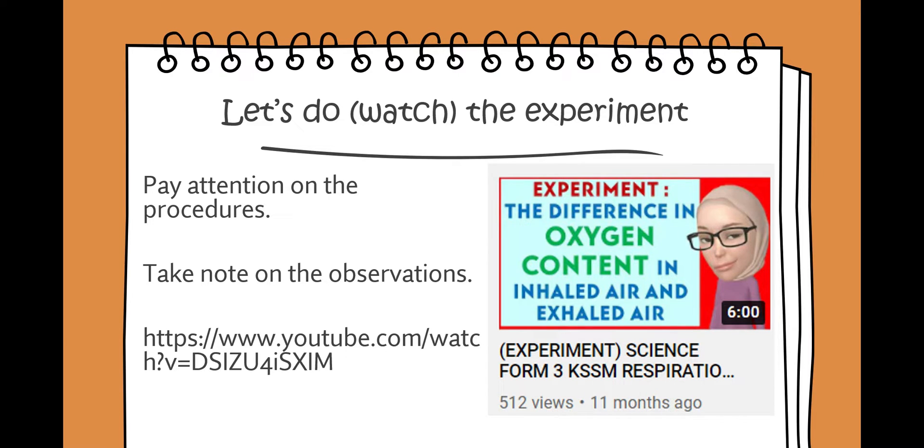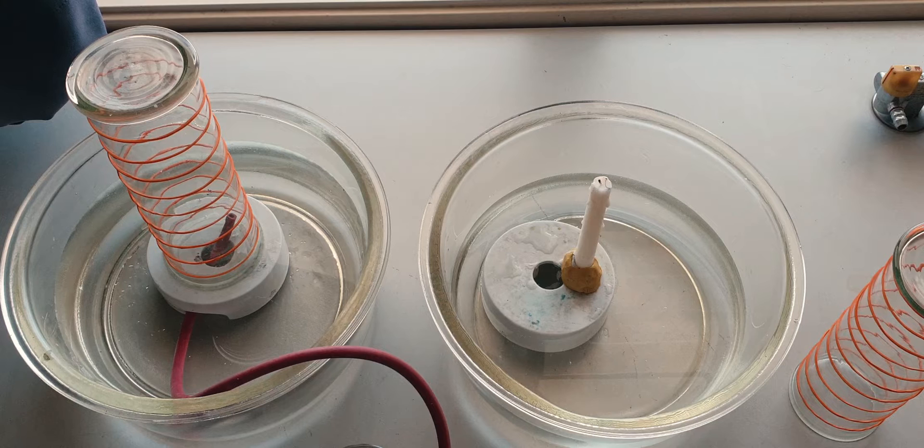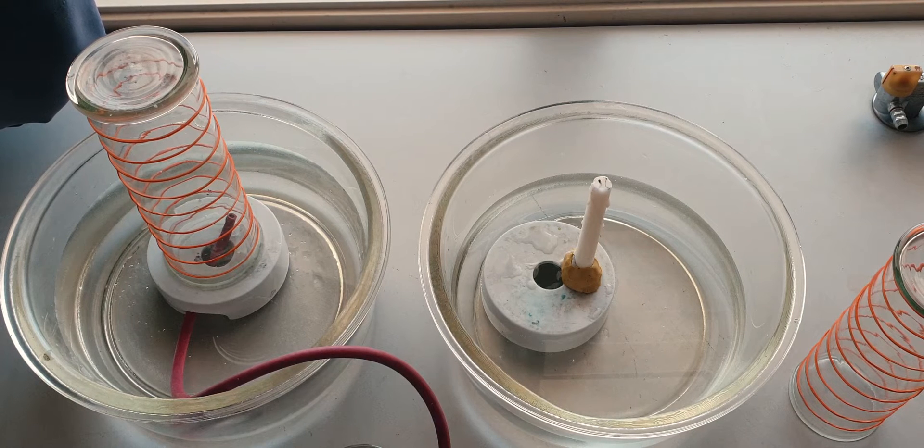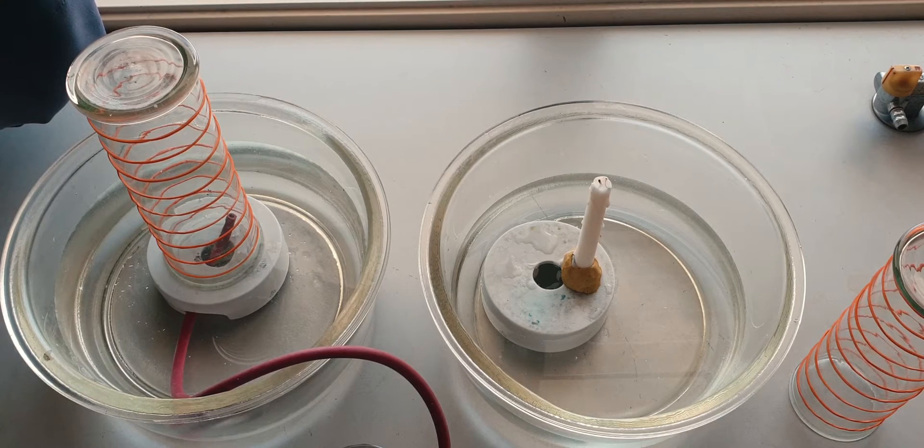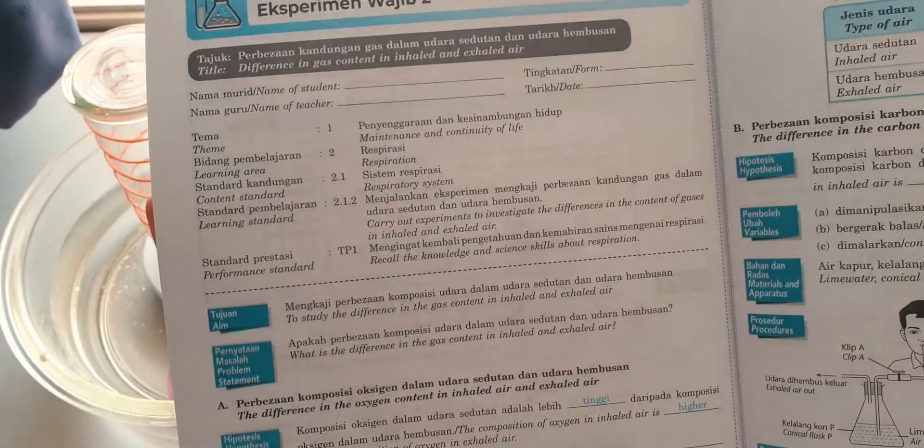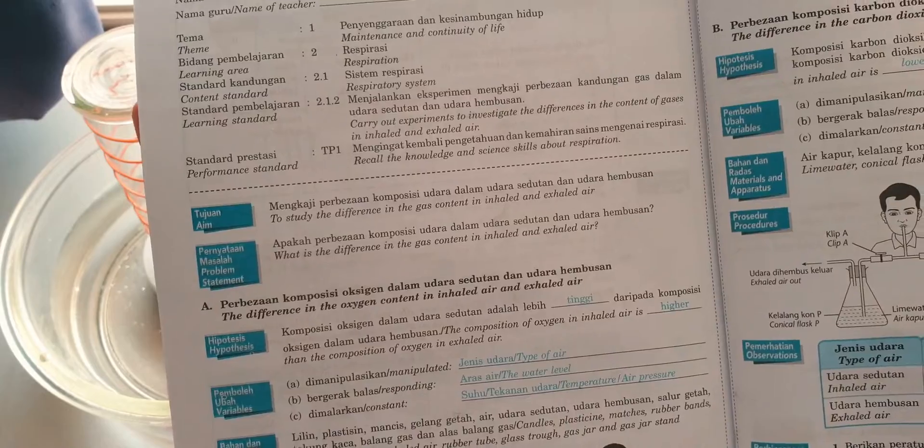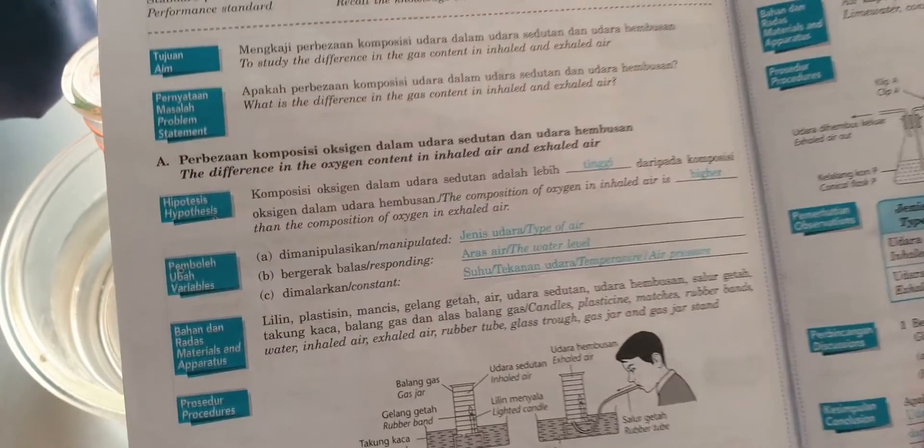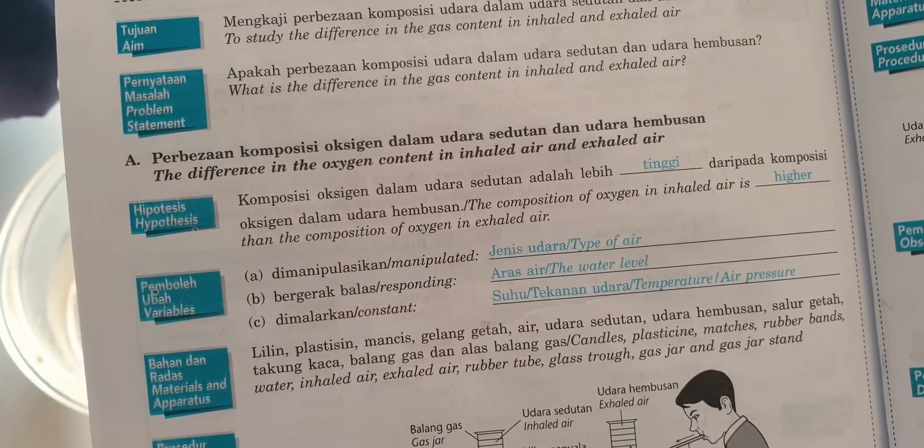I'm going to show you how we're going to compare the composition of the inhaled and exhaled air. This experiment is a required experiment. The first experiment is to study the difference in the oxygen content in inhaled air and exhaled air.